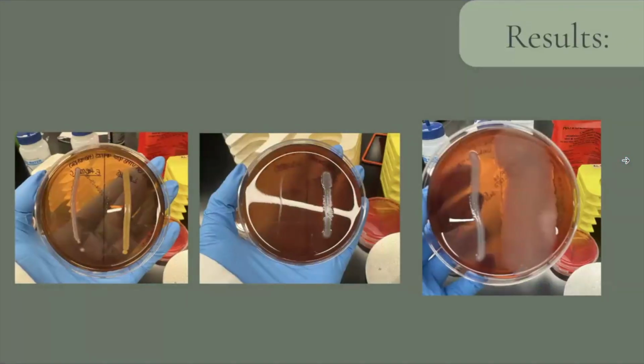Results. In the first one, the blood agar hemolysis test on K. pneumoniae, which we see right here, it's shadowy but looks normal. So we interpreted this as gamma, no hemolysis, because there's no change in the agar around it. And the S. pyogenes, right next to it, we didn't see any growth. This could be due to human error or might have been from burning the culture, but further reading in the lab manual, it should have been beta.